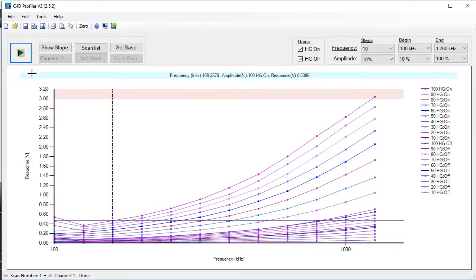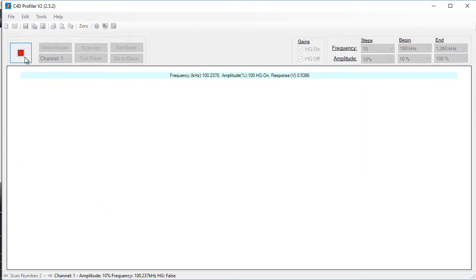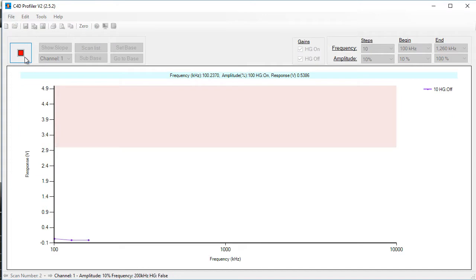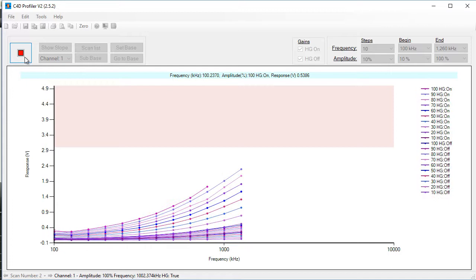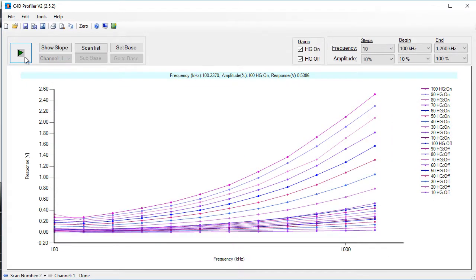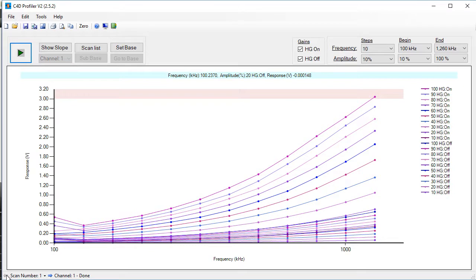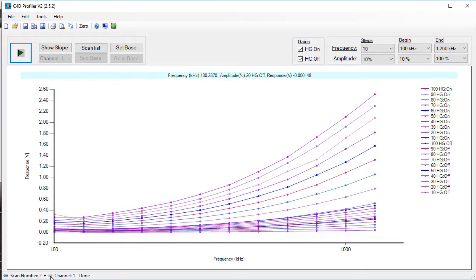Now we're ready to do a second run, so click the green arrow. Now it's going to do a new second profile with the diluted background electrolyte. When it's finished, you should see a very similar profile to the first one. We can change between the first scan and the second scan. In the second scan, which is the diluted background electrolyte, the points show a slightly lower response.